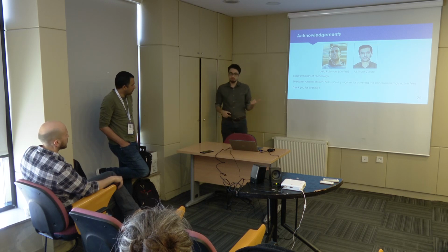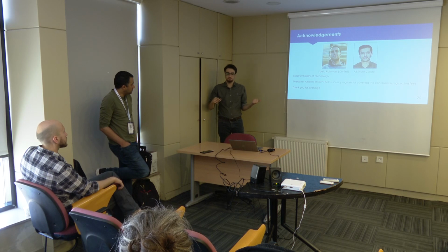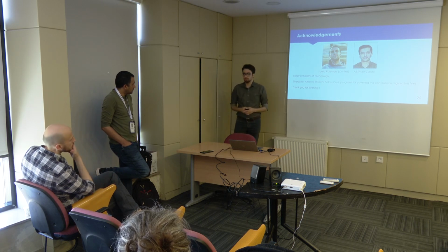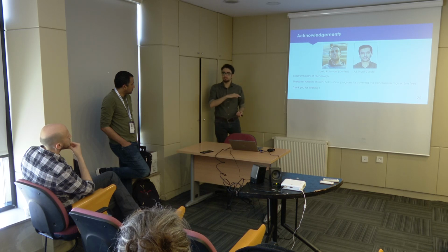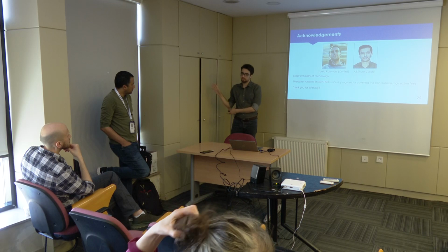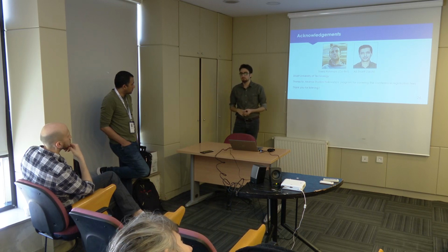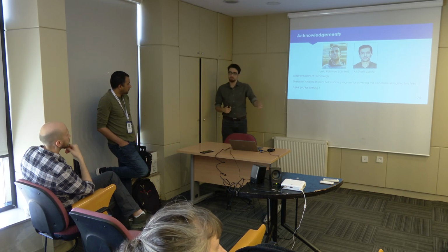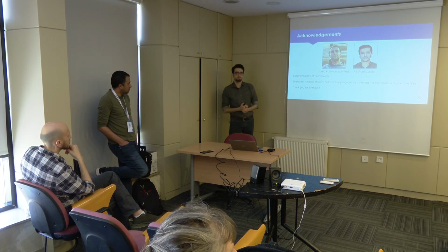So in our case, we are actually trying all of the combinations of 2, 3 and 4 genes, because the genes are about a few thousand, and we are using CUDA and parallelization to calculate all of them. But for a higher number of reference genes, maybe your suggestion would be applicable.